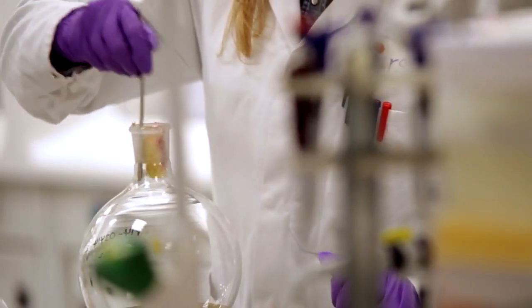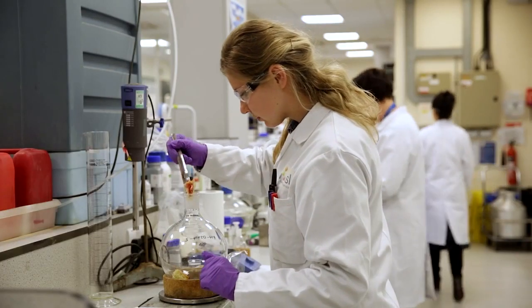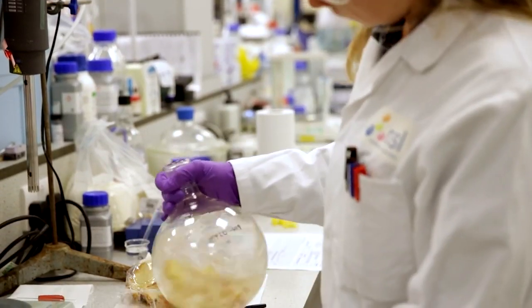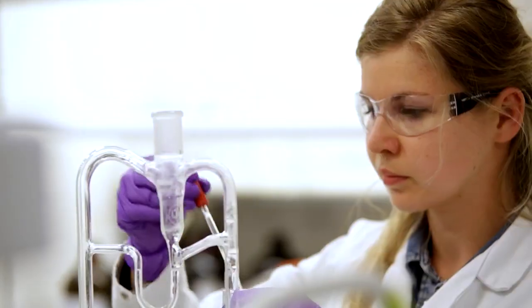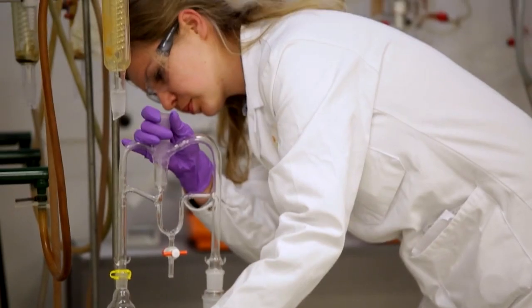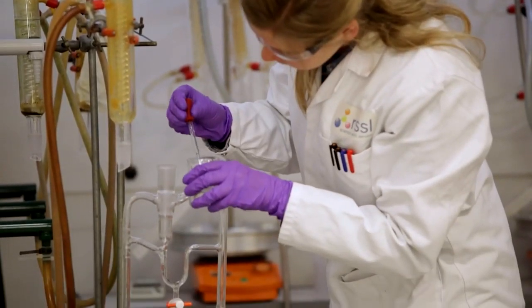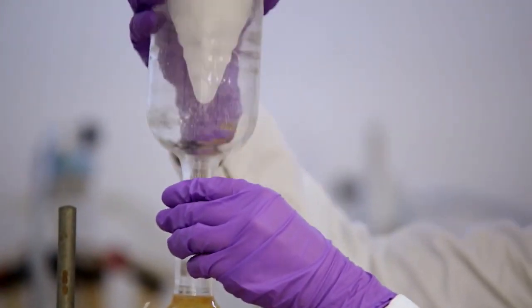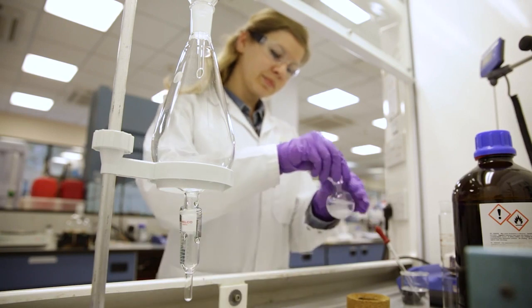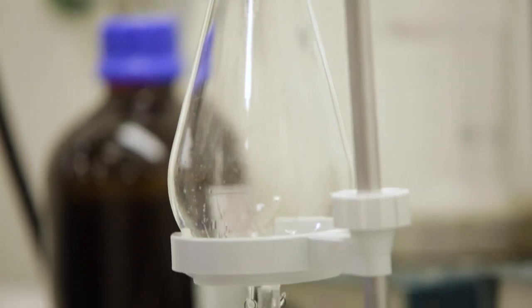To allow a more exhaustive isolation of volatile compounds, a steam distillation solvent extraction is conducted on both the control and test samples. Each sample is co-distilled between two solvents, generally water and an extracting solvent. The mixing of the vapours enables extraction of the volatiles into the co-solvent. This is typically followed by a concentration step to give better sensitivity, as tainting compounds are often present at very low levels.